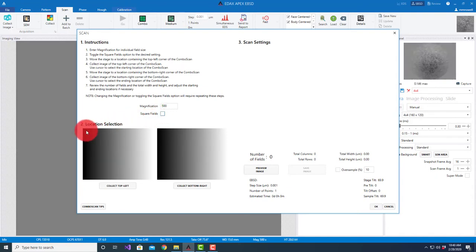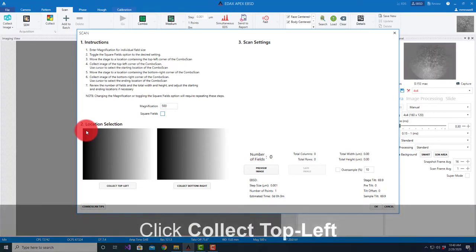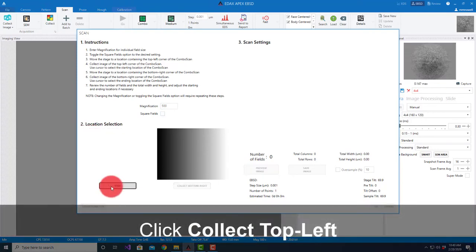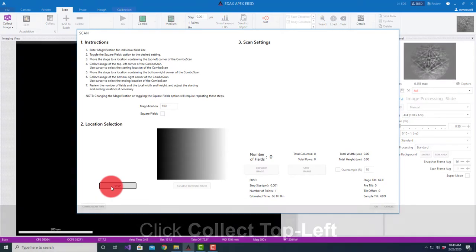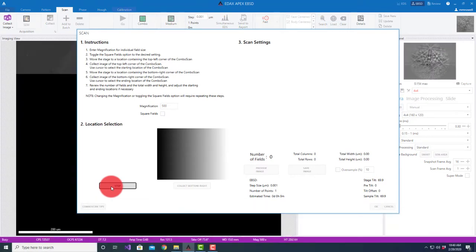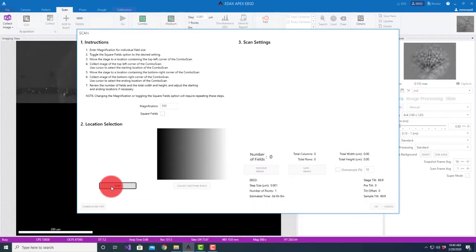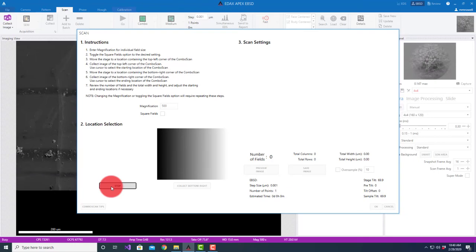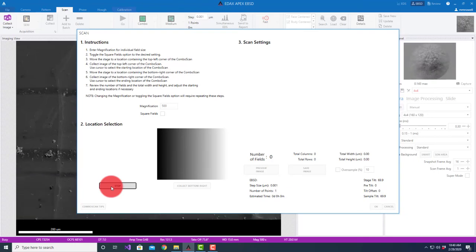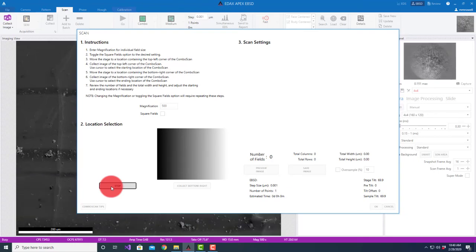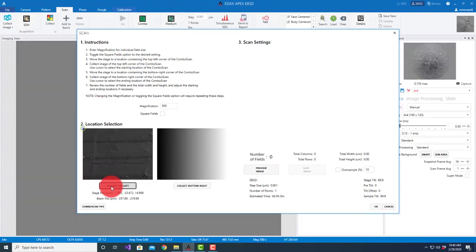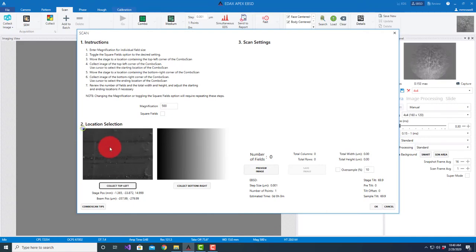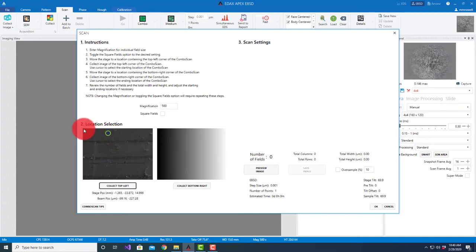I'm going to select square fields to set this up. If we follow this out, right now I'm on the microscope in the top left position. I'm gonna hit collect the top left image. It's going to take an image here and within that image you see it's put my starting location in the top left.